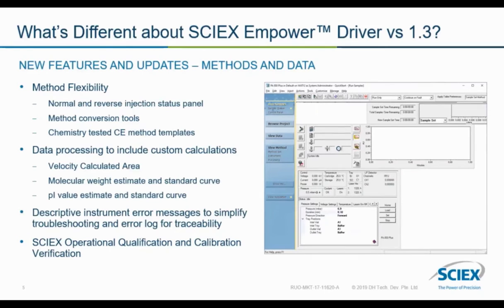Keep in mind that you will need to revalidate those methods, as we have added additional fields in version 1.3. We also have added chemistry tested CE method templates, and I will be going over what some of those method templates include.